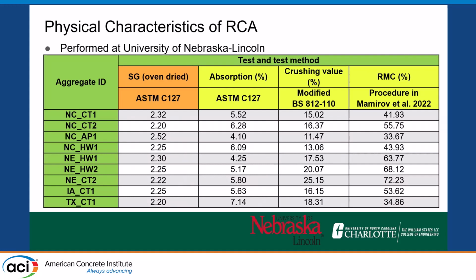A lot of this work was performed at UNL and was part of this morning's presentation by Dr. Hu. Essentially, we took a look at our specific gravities and absorptions. The University of Nebraska team has developed a more standardized and efficient protocol for crushing value and residual mortar content that I would love to direct you to. These tests are not new, but one of the problems in the literature is that, although useful, folks have not standardized them, or they explain how they did it but leave parts out, and don't come up with a complete protocol optimized for getting results with confidence. I direct you to the final report.